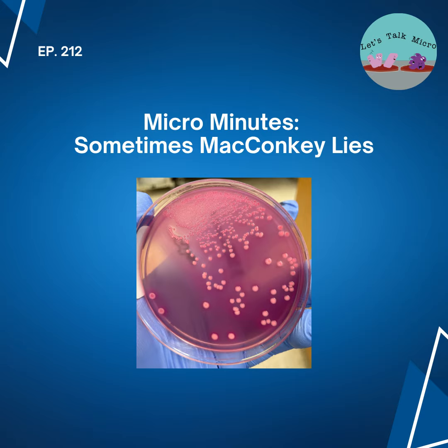People have received this ID and then accepted it, and this is not responsible microbiology. So do not assume when it comes to MacConkey. As always, do a gram stain, see the patient history, look at the whole picture. If the culture had a direct smear done, check that too. Correlate everything, but do not assume.